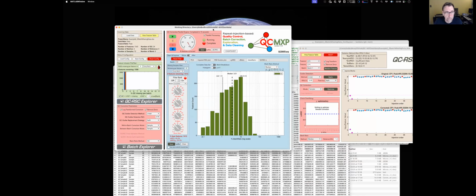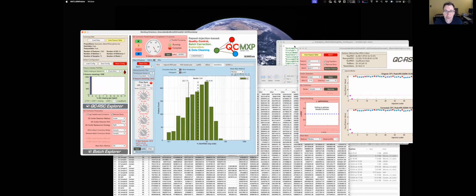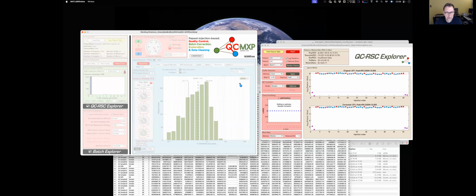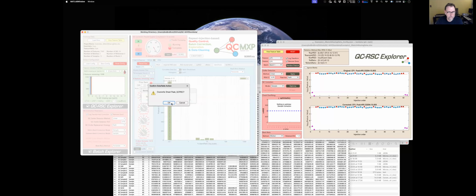So that's what Rick Dunn would tell you if he was in the room. Last time I spoke to him on the subject matter, his opinion might have changed. I also implemented something called percentile. And this, you'll see the distribution looks a lot different.